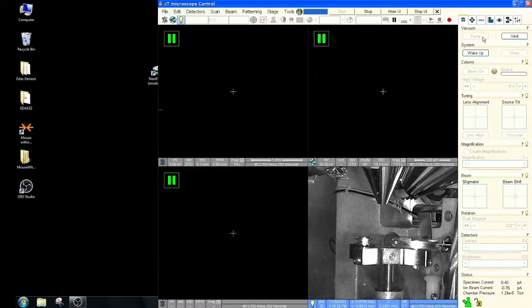So what makes this microscope a little different is that we're still using a fairly old version of software made by EDAX called Genesis, which all the rest of the microscopes in the lab have moved on to TEAM software. So the setup on the Nova is a little bit different than the other systems. But the basics of EDS detector setup and EDS mapping are all pretty similar. So once you work through the differences in the software, it should be pretty straightforward.